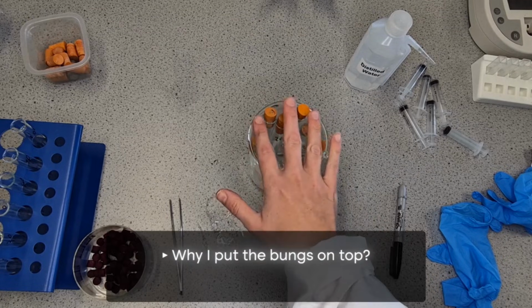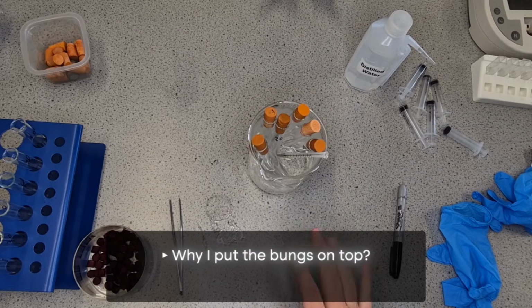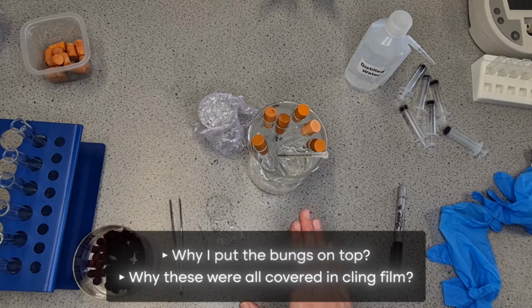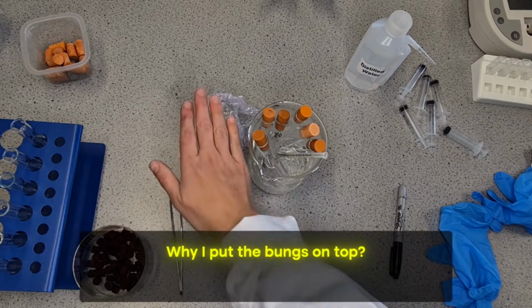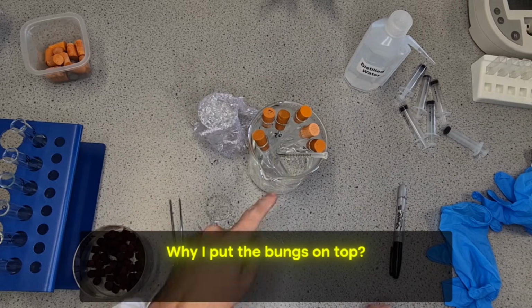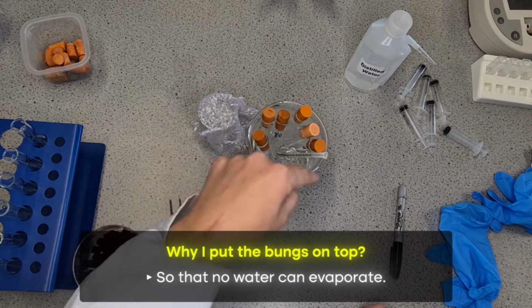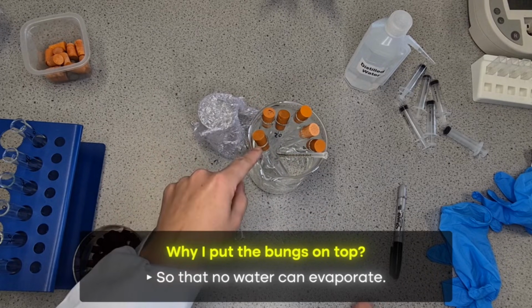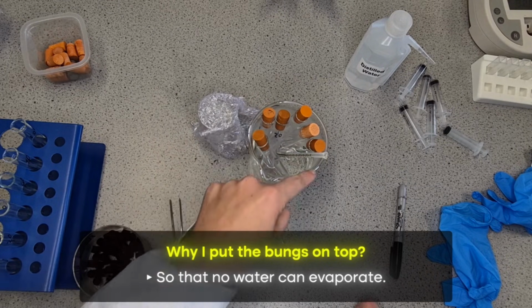So at this point, I'm just going to go through why I've put the bungs on top and why these were all covered in cling film, because this is a key question that students get asked in the exam to make them aware of. We have to put the bungs on top and in this case cover it with cling film because the water within those solutions will evaporate. And if the water is evaporating, that now means we'll have a more concentrated solution remaining.